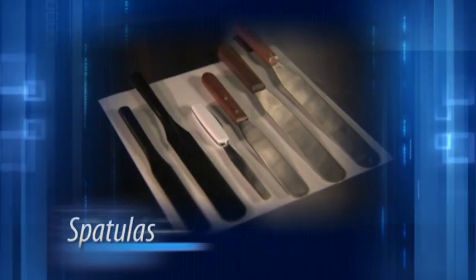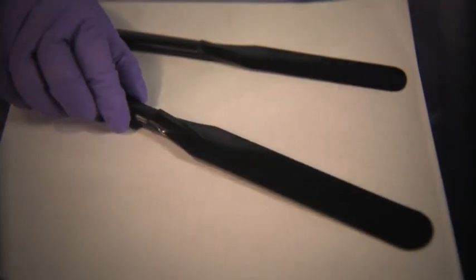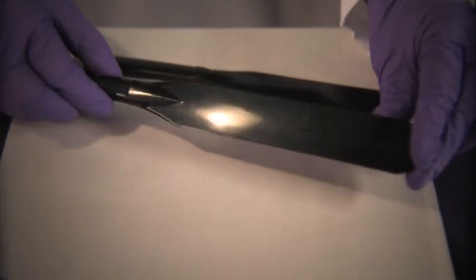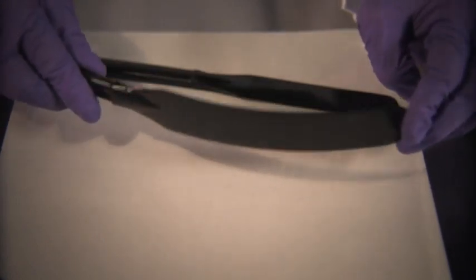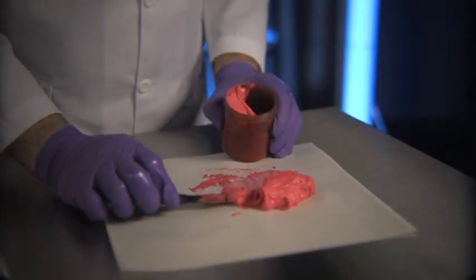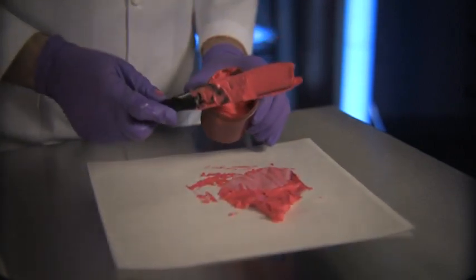Spatulas are usually made of hard rubber or stainless steel and are used for counting tablets and capsules, transferring solid material, and mixing liquid or semi-solid dosage forms. Spatulas are available in a variety of sizes. Despite their name, hard rubber spatulas are somewhat flexible and are best used when counting individual tablets or capsules. Rubber spatulas are useful in spatulation, which we will demonstrate later, and mixing other materials.